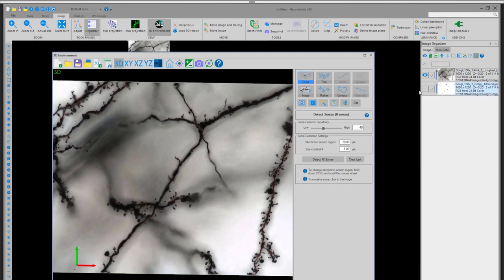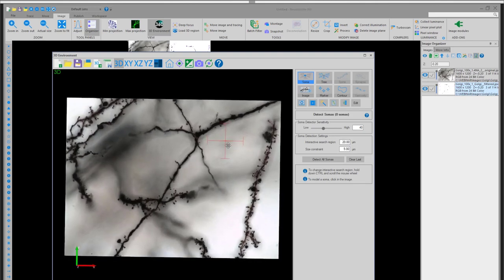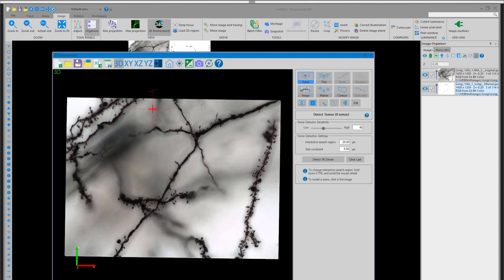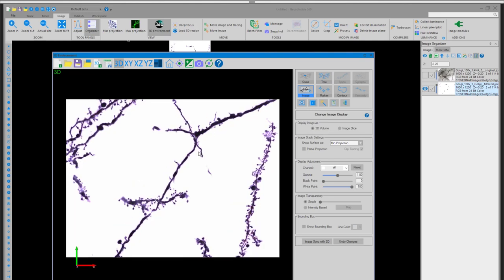Rather than running through the entire filtering process, we've done it already. In the 3D window we can see the original image with Z blur visible around some dendritic spines. Using the image organizer tool, switching to the filtered image — run through the Golgi filter — really removes that Z-axis blur, minimizing any staining that might get picked up during automatic or manual detection of processes like spines.